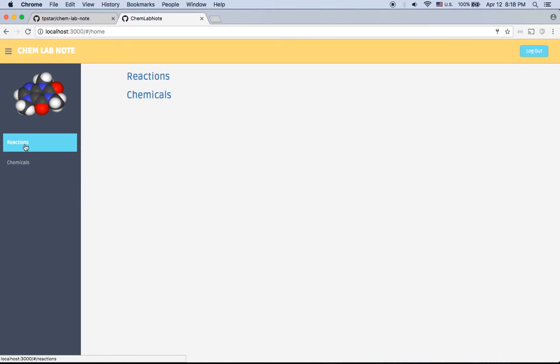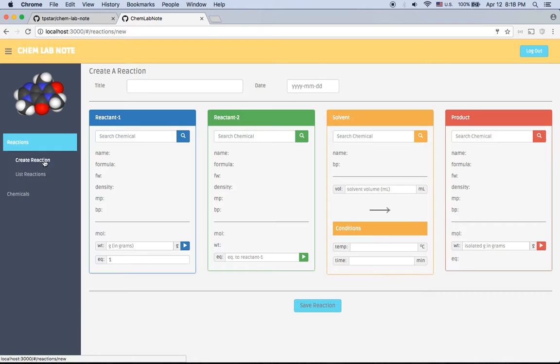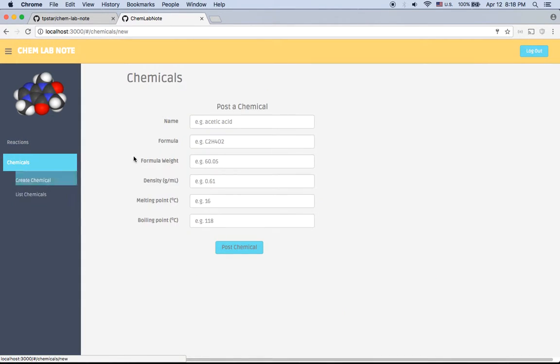So to record your reaction, you're going to call chemicals that you want to use in the reaction. So let's first create a chemical.